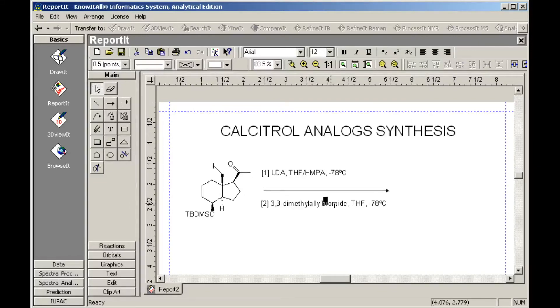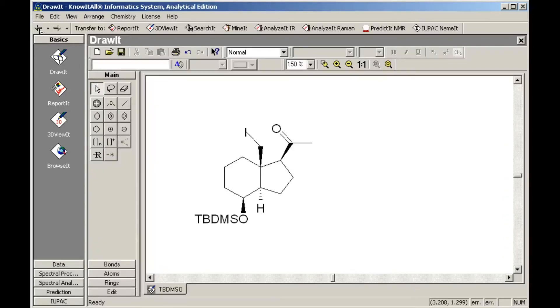To add the next structure to the reaction, we will modify the original structure in the DrawIt application. There are several ways to access tools in the DrawIt application. One of the easiest is to right-click, then select the tool pallet from the pop-up menu. You can also quickly open the tool pallet by using the Control-Right-click shortcut.